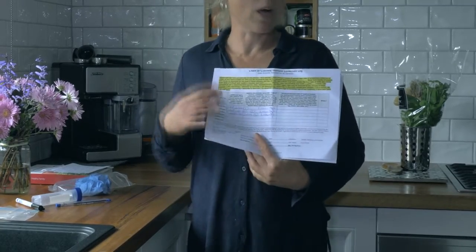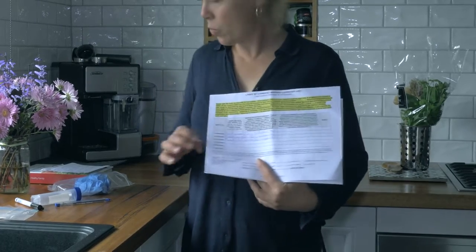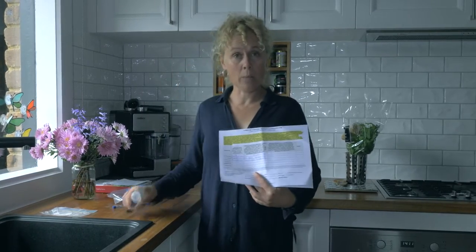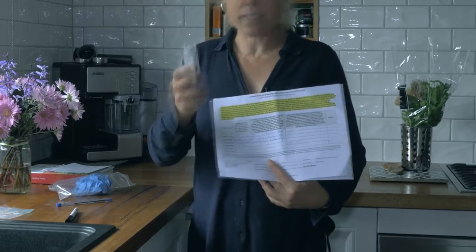And in this example, I use the lead group. They have the sample number here. So I want to make sure with the tube that comes in the kit, with a permanent black marker, I'm going to write the sample number on the tube. I want to write the date. I want to write where it came from, the drinking water. So I'll write kitchen tap.